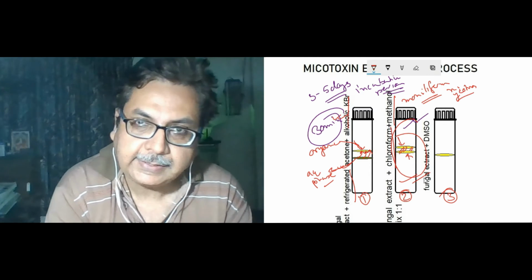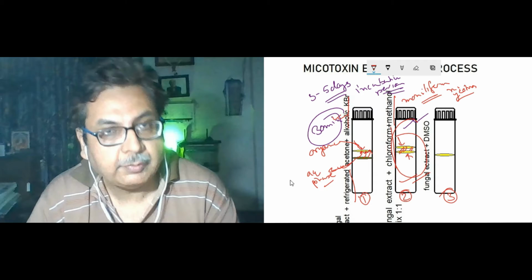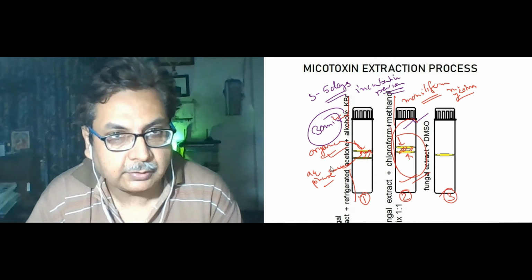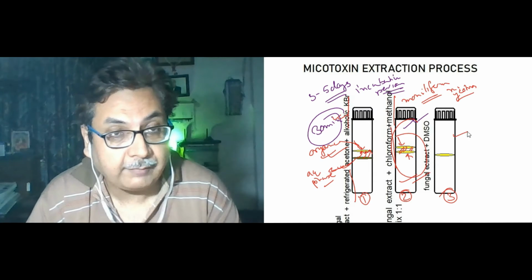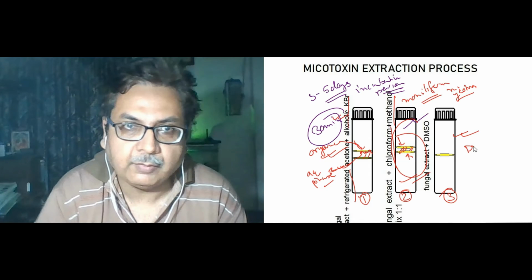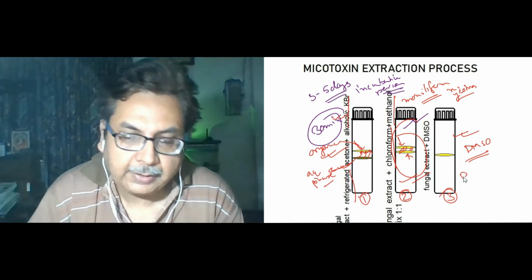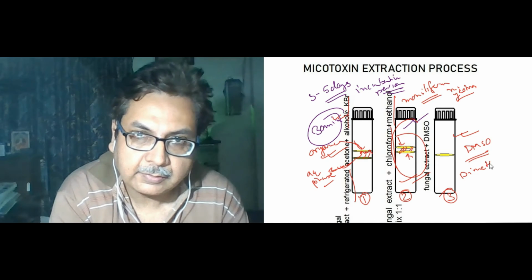This system is not preferably used, because if you do not know the mycotoxin of the fungus, if you are not definite about the mycotoxin, you cannot use this. If it is not moniliform, then nothing will come. So it is better to use the first method.